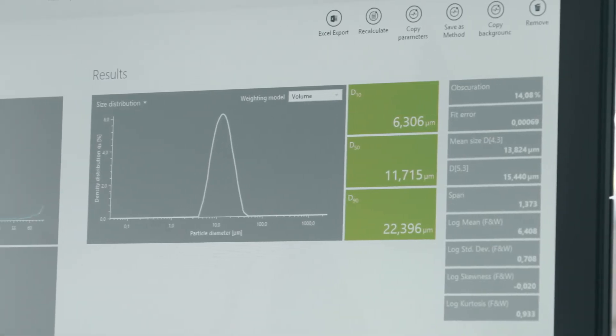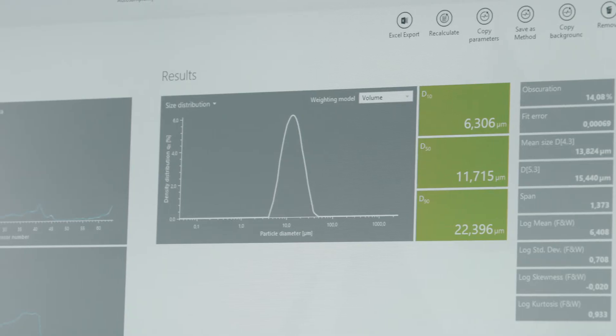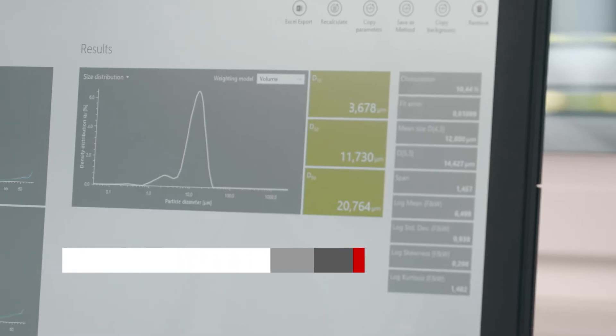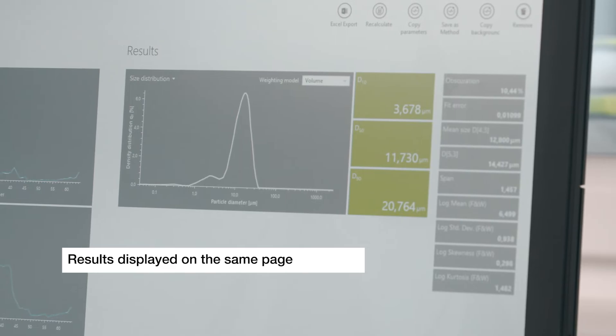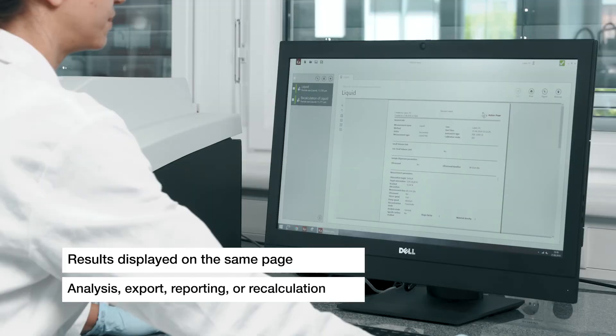At the end of the measurement, the results are displayed on the same page with the measurement setup. From this point, the measurement can be analyzed, exported, compared, and reported or even recalculated with different settings.